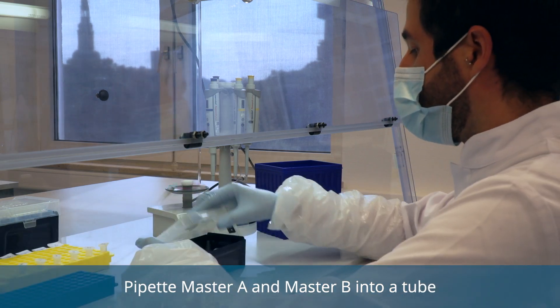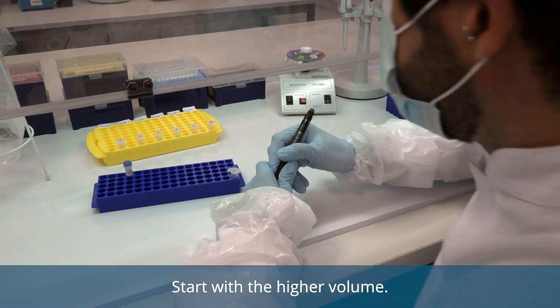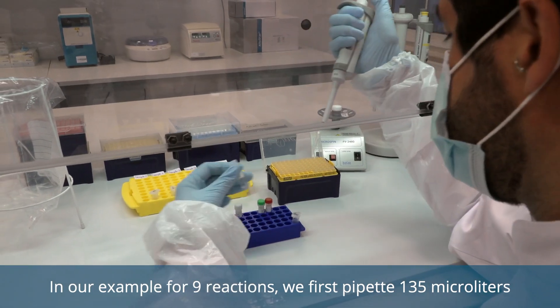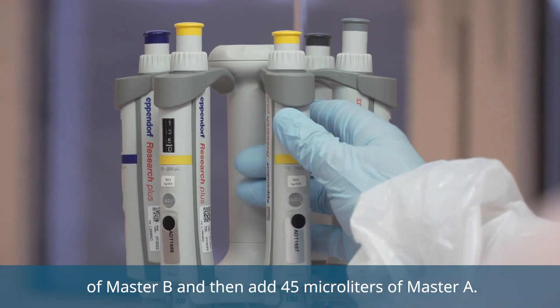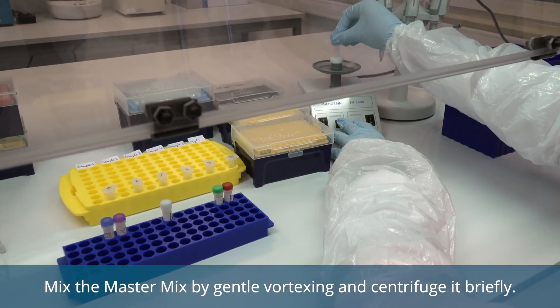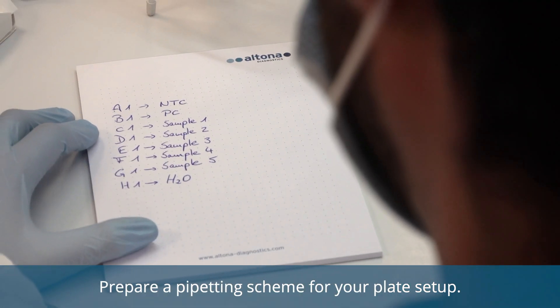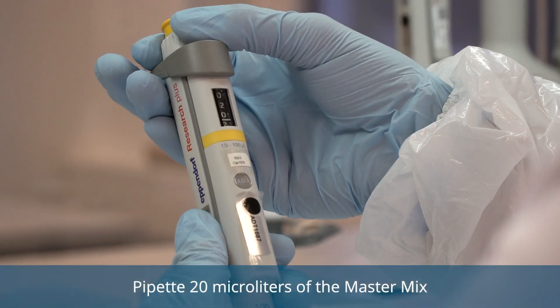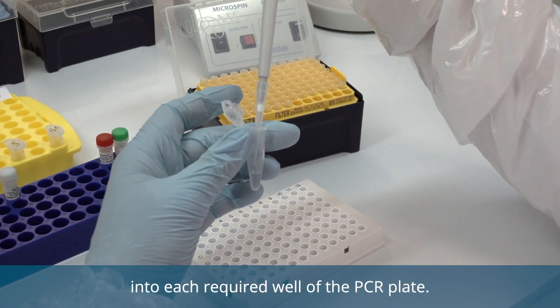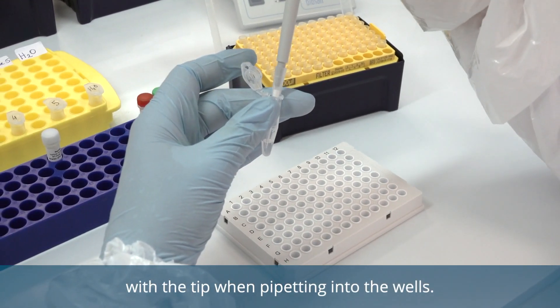Pipet master A and master B into a tube prepared for the master mix according to the calculation. Start with the higher volume. In our example for nine reactions, we first pipet 135 microliters of master B and then add 45 microliters of master A. Mix the master mix by gentle vortexing and centrifuge it briefly. Prepare a pipetting scheme for your plate setup. Pipet 20 microliters of the master mix into each required well of the PCR plate.